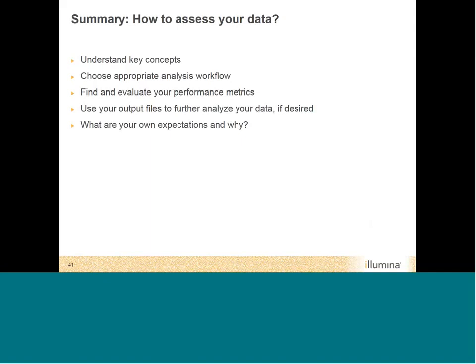It's always important to know what the expectations are and why we have them. This is something that we always want to think of when we are trying to decide whether our project went well and what the metrics are that we want to really focus on. And then also I encourage you to compare your data to the expected values that are provided either in the slide deck or also in the respective kit data sheet.